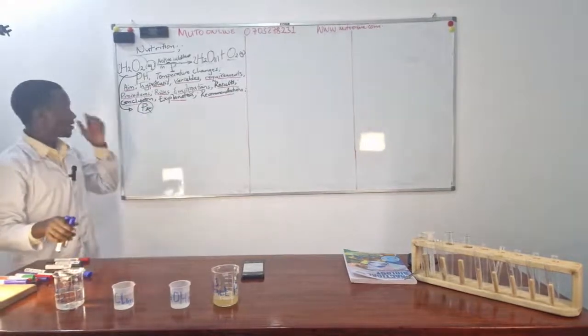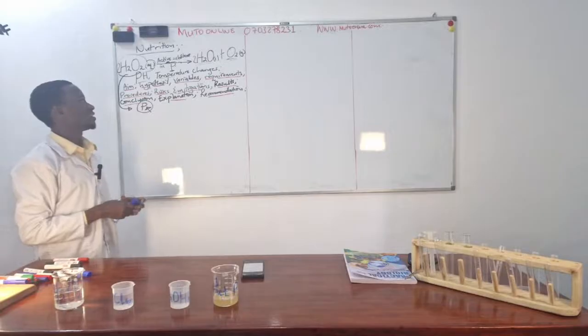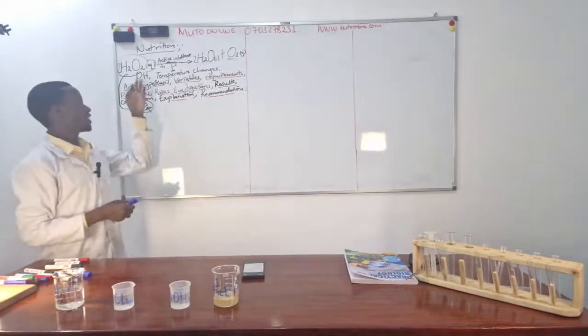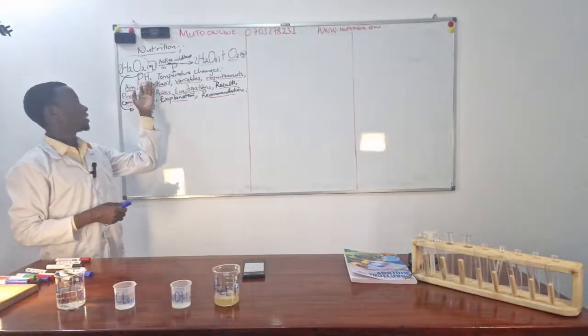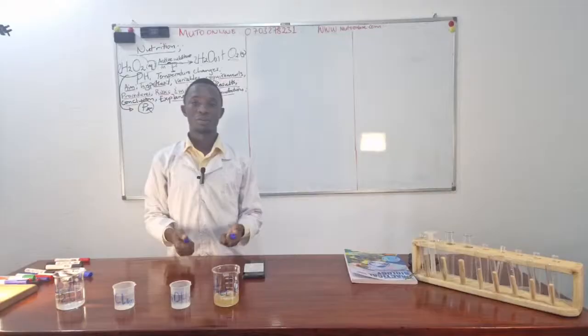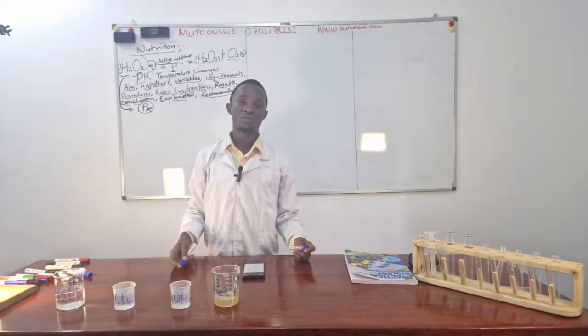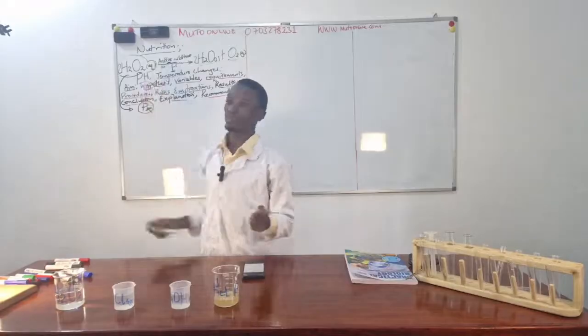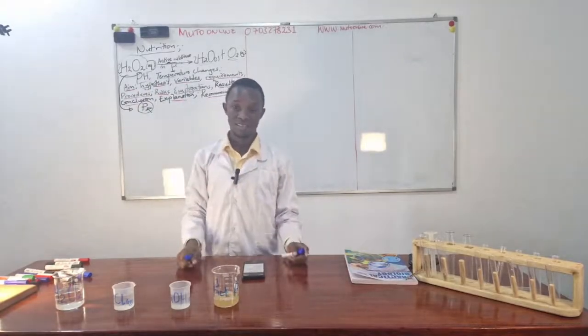So we are here to help the manager make the best choices of conditions. The conditions they are talking of are these factors: the pH and the temperature. Under which ranges of temperature should they carry out this process of removing these traces of hydrogen peroxide using P?